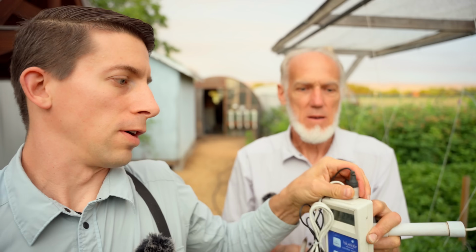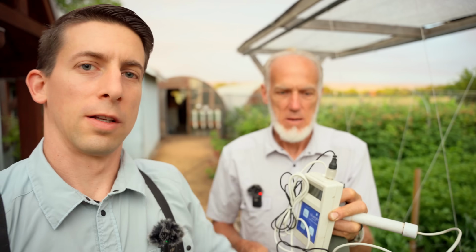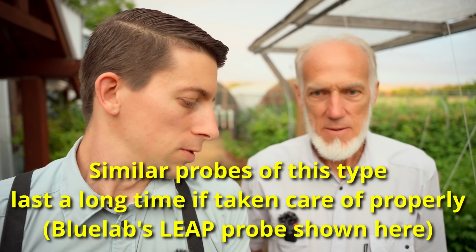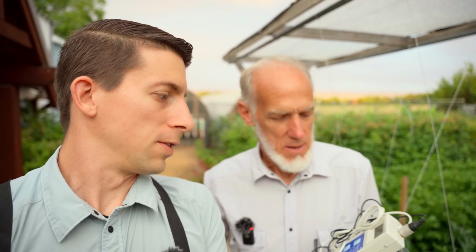And you can undo this right here. See, I can do it without looking. And you can put it back on like that. There. So you can replace the probe. The probe's like $100 on this one, and you get a new probe whenever it wears out. So that's pretty handy. And then this probe right here is good for liquid solutions and soil.